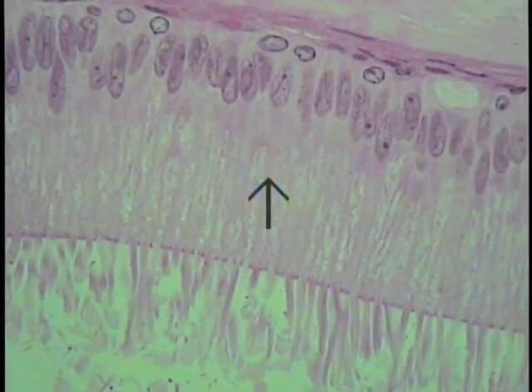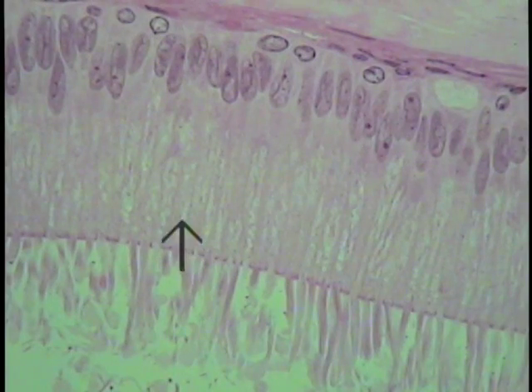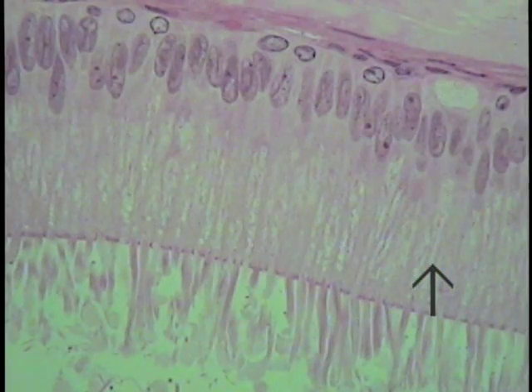The Golgi complex of some of these epididymal cells are extraordinary, and this is why you have this vacuolated, large appearance in these particular cells in their supranuclear and apical region. These are huge complexes made up of this Golgi complex and apparatus in this particular epithelium.